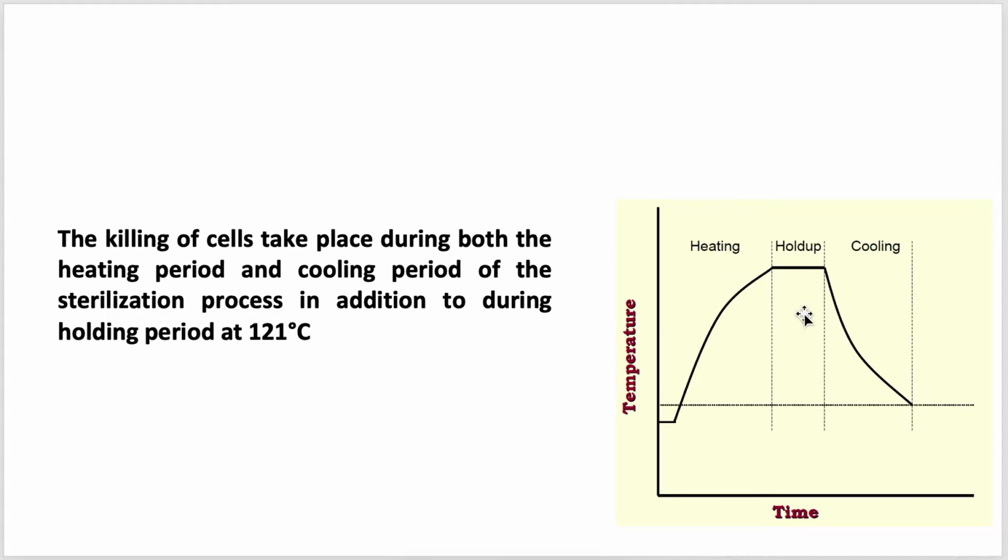However, most of the destruction occurs during the hold up period. Okay, anyway, although most of the microorganisms get destroyed in the hold up period, when we calculate the time required for batch sterilization, we need to consider the destruction of microorganisms in all these steps, that is, how many microorganisms get destroyed during the heating, hold up and cooling period. So we'll consider all these steps.